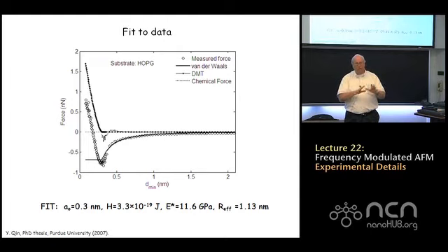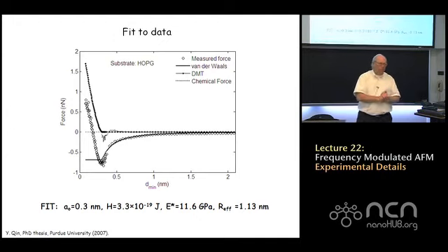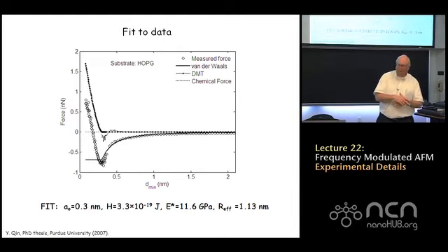It takes a lot longer to do a UHV experiment. It's not something you just do on a weekend. But I hope you'll agree some of the results I'll show next lecture are pretty spectacular. There are at least a few groups in the world that have the money and the infrastructure to do those experiments. Very expensive. Very time consuming.